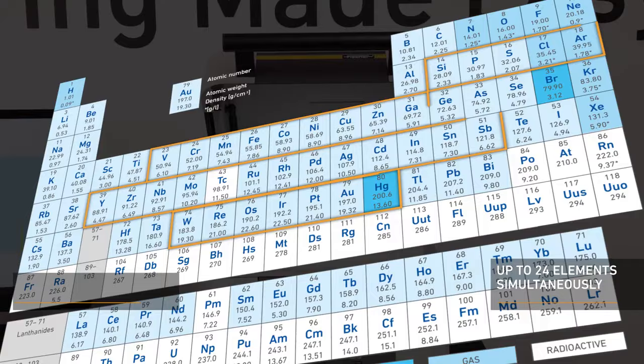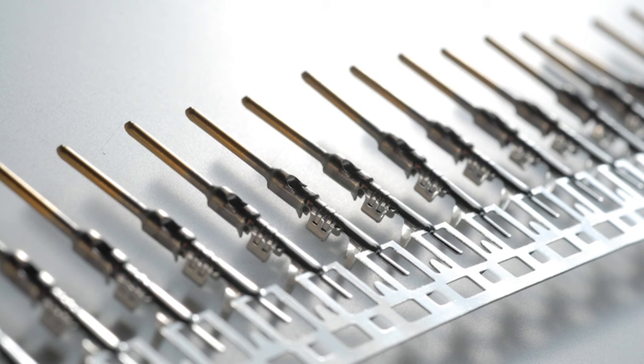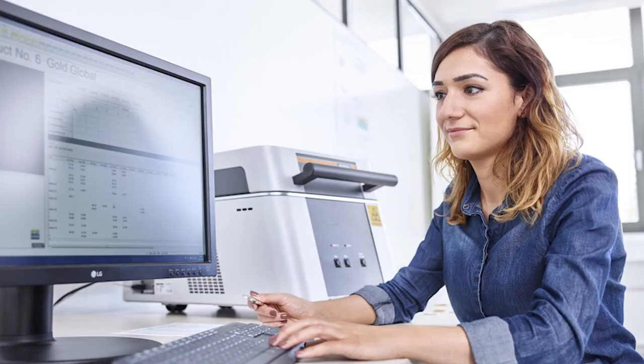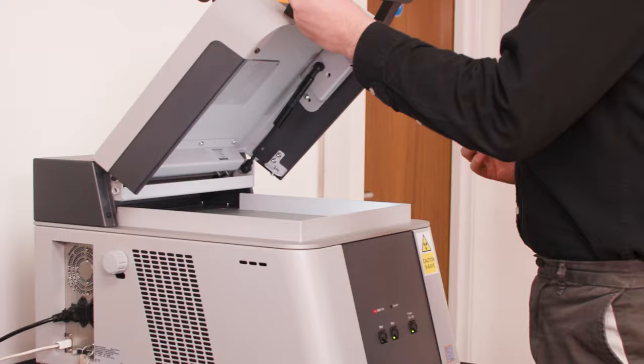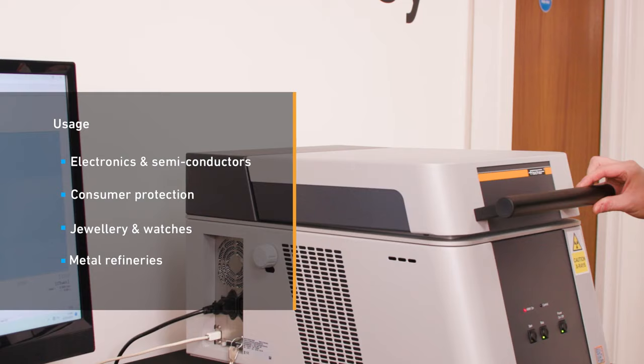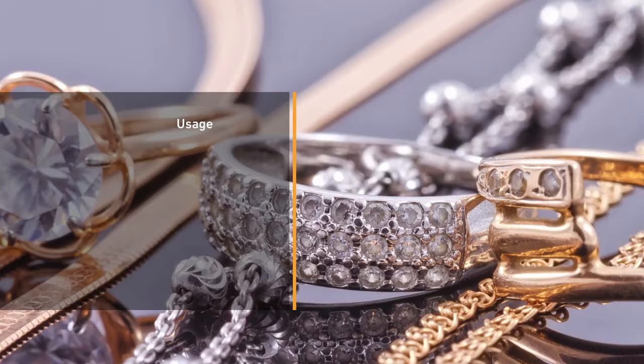So, what can you measure? You can measure a wide range of elements simultaneously during your quality testing with just this one instrument, ranging from aluminium to uranium. The instrument has a high resolution video camera with zoom and four different aperture sizes to enable easy sample positioning and precise measurement spot adjustment. It can be used for measuring functional coatings as thin as a few nanometers in electronics, trace analysis for consumer protection — for example, lead content in toys — and analysis of alloys in the jewellery and watch industries and metal refineries.